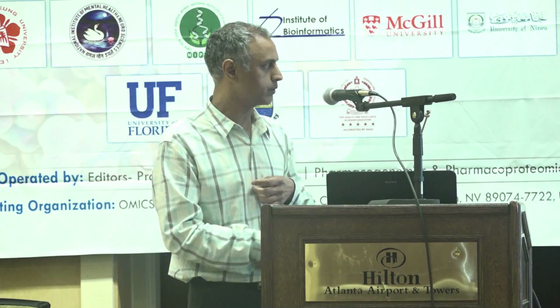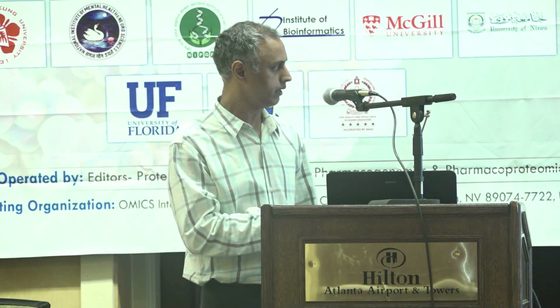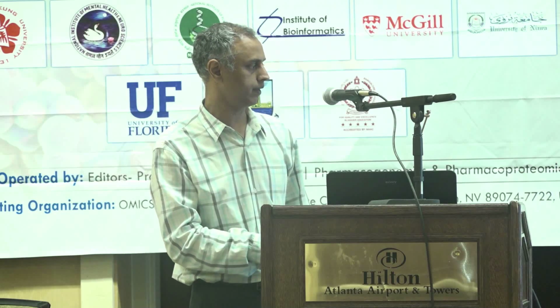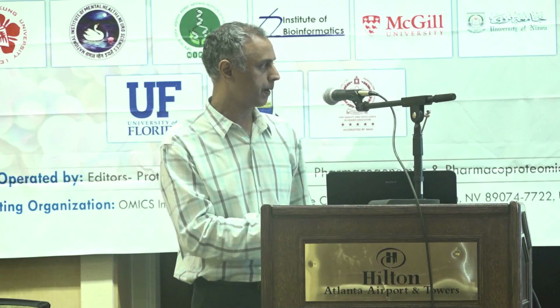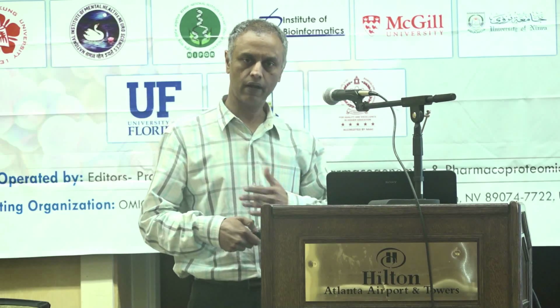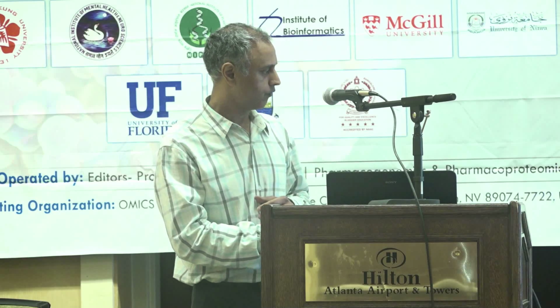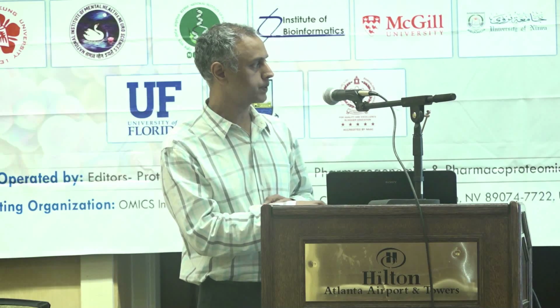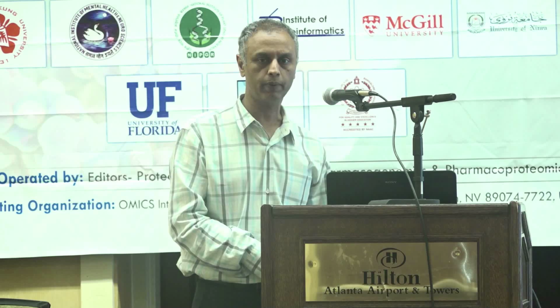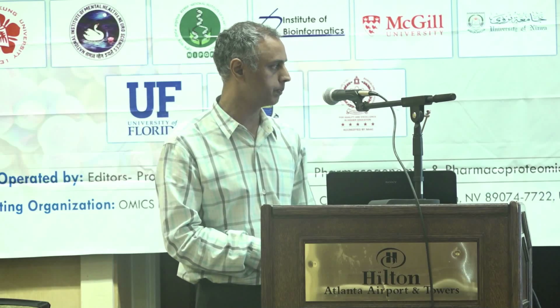And what we would like to be able to do is also a quick screen to definitively identify MTB, because cultures take 4 to 6 weeks. And here again, we designed these assays where we could target these peptides that come from Mycobacterium tuberculosis. And this is now using parallel reaction monitoring. And in these 4 cases, we can easily see that this peptide that comes from MTB is there. And these 2 samples come from this other atypical mycobacterium, Mycobacterium abscessus, and we don't see it. So again, you have a nice differential diagnosis built in there.